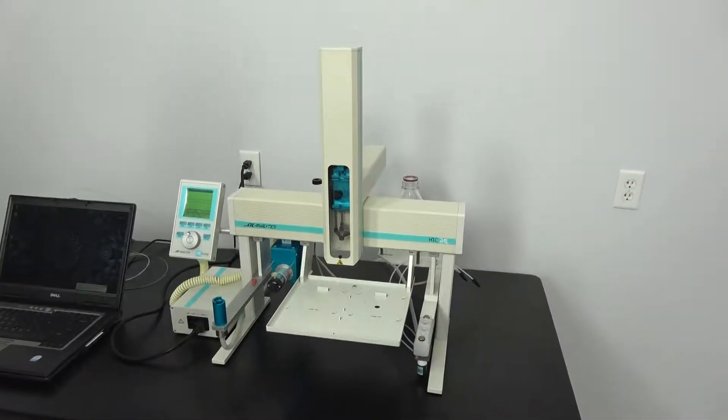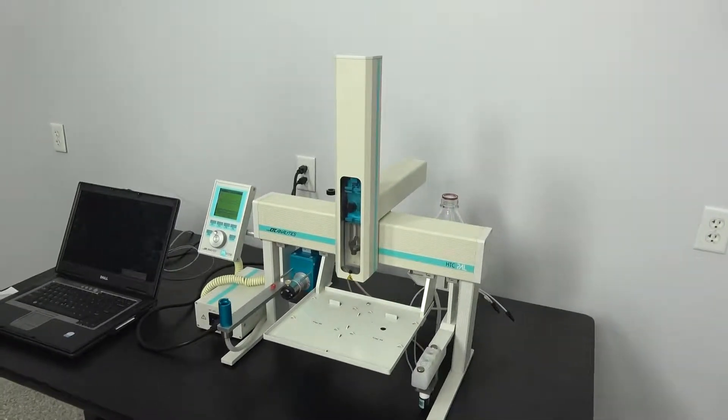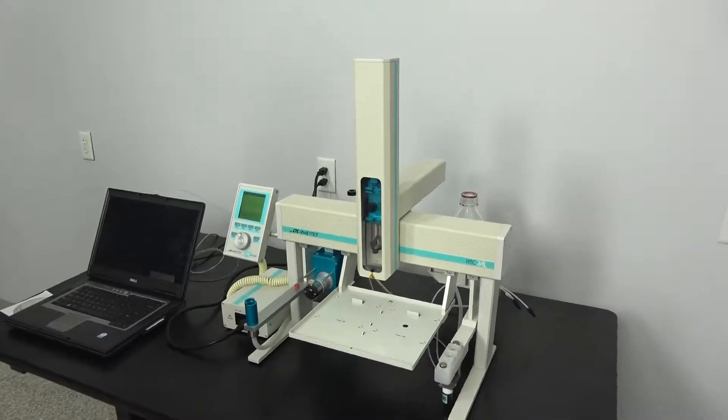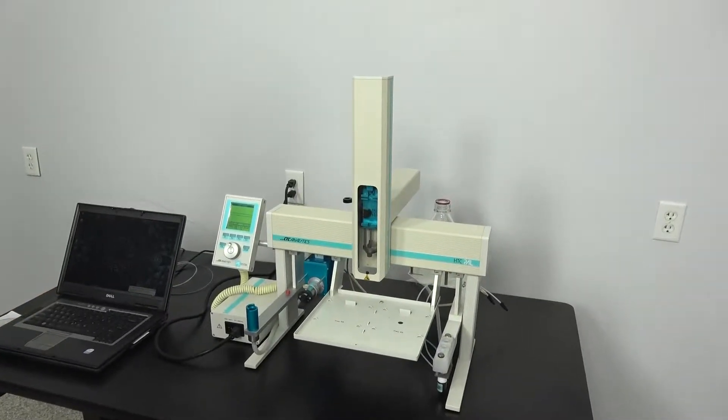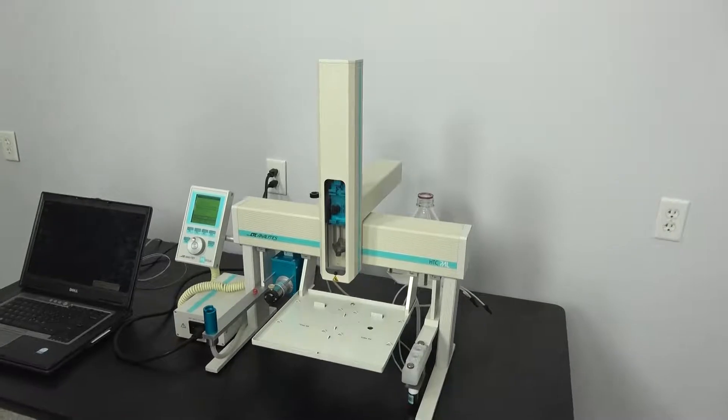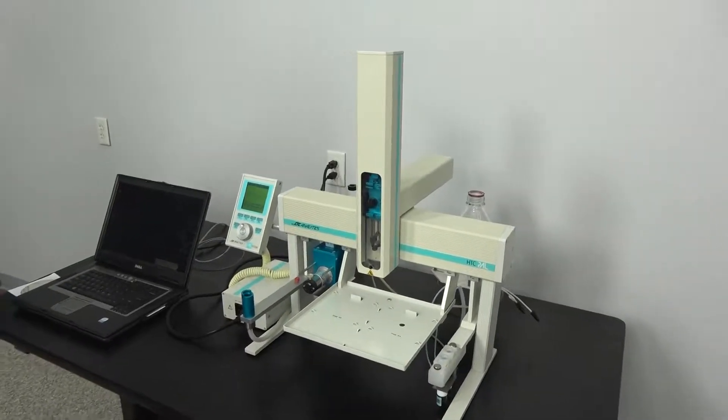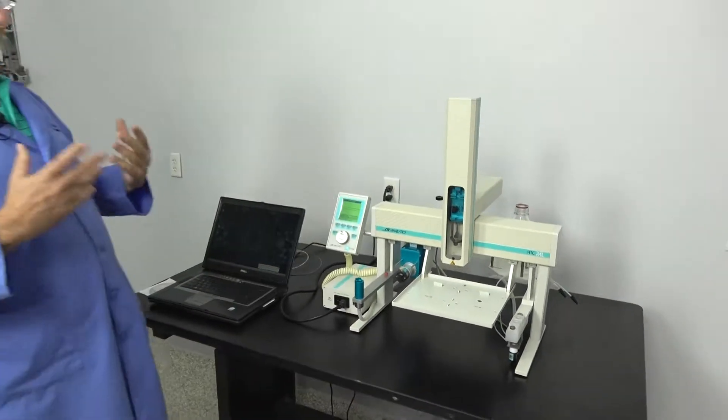It can be configured for gas chromatography or liquid chromatography. This particular unit is very short. They do make the HTS, which is a much longer unit, and the double-headed unit. There's a wide variety.